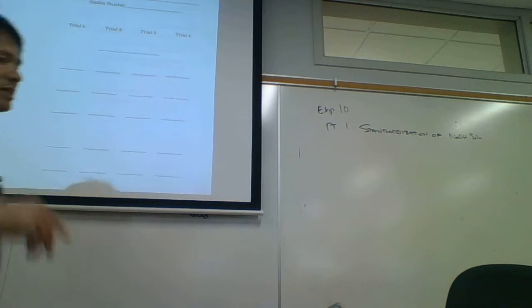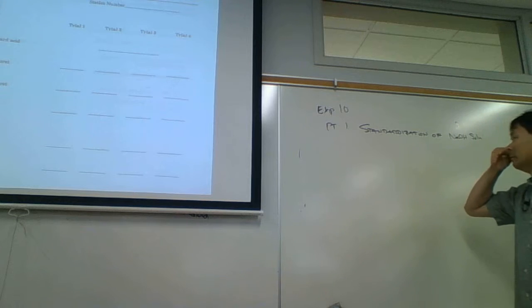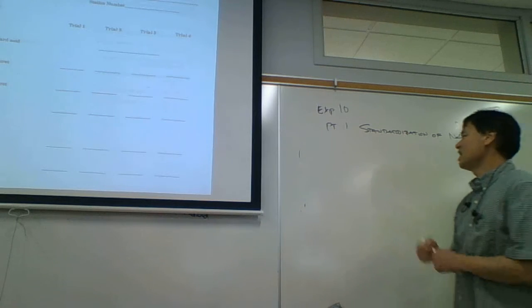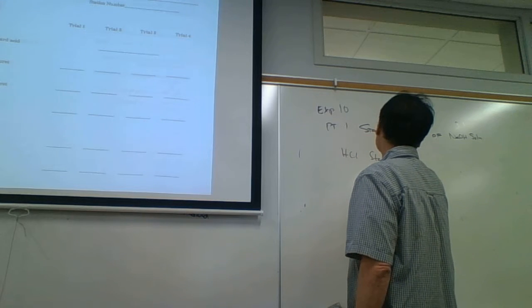Well, yeah, the representation would be, in this case, the composition. And so when we standardize this, we want to make sure we know the composition of this to a high degree of accuracy and precision. And we use the HCl standard solution for this.